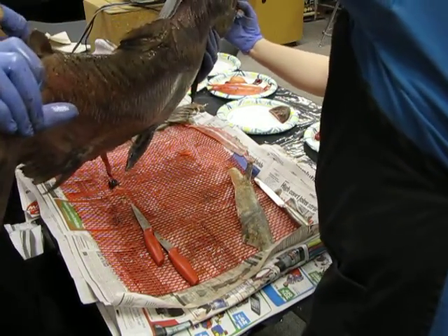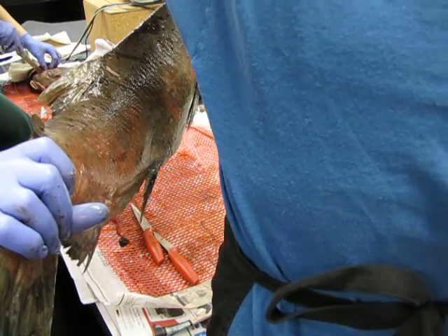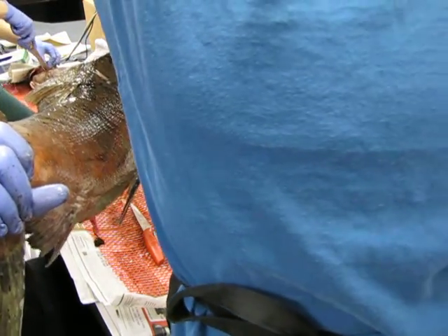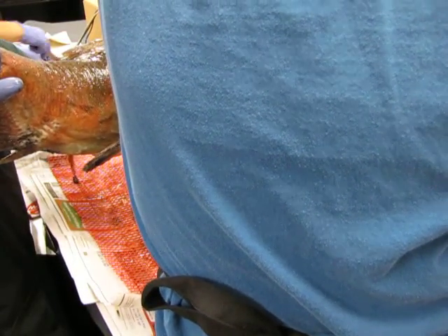The salmon teeth, they're big and sharp, and they're pointy, and they face in. Can you see how they're going in? I'll turn it for you. And that's green team. They go in. They're big and sharp. See, Ollie? A little bit. Lean over.